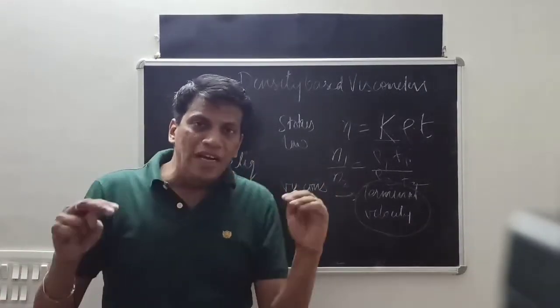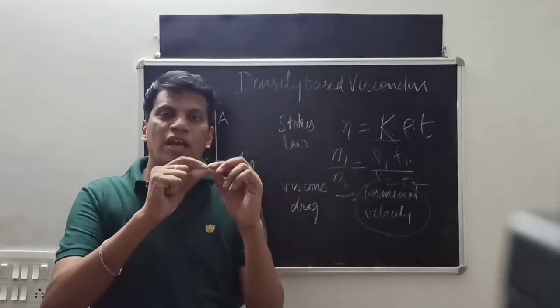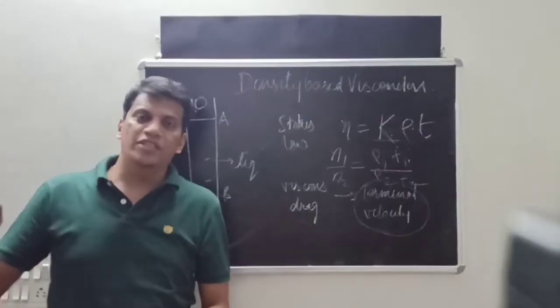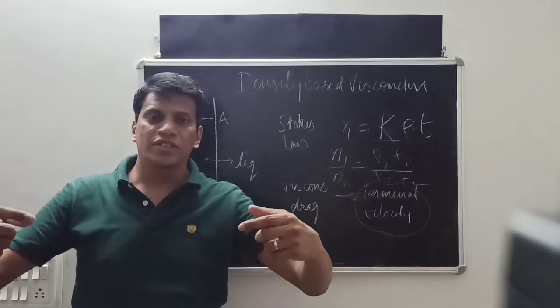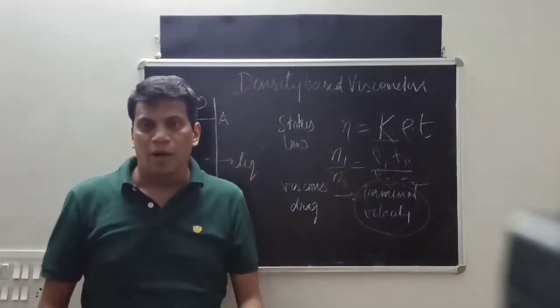They are filled such that a small amount of air remains, and in the 10th tube we fill our test fluid, with a small amount of air remaining in this also. Then we invert the whole stand. When we invert it, a bubble is formed at the bottom and starts to rise up.